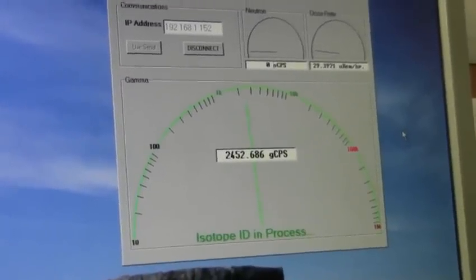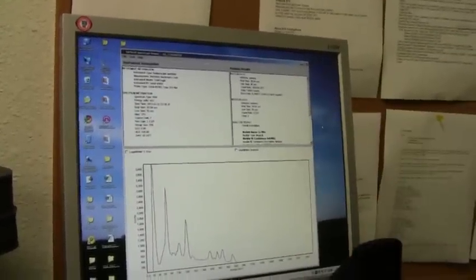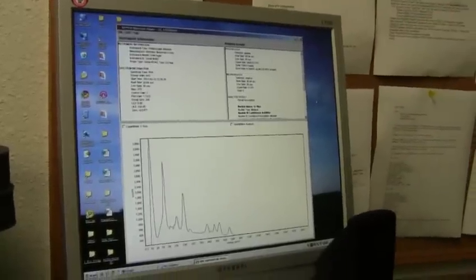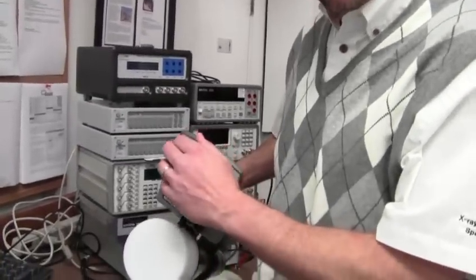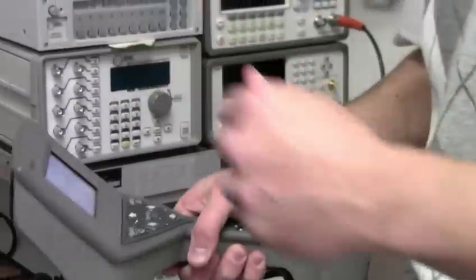This will be done in three seconds. Once the SAM is done doing the analysis, the spectrum and all the correlating data is immediately sent to the user over the Wi-Fi network. This is very useful for an expert in a remote location to view data in real time and support the first responder or the inspector who maybe doesn't have the spectroscopic experience to analyze more complex spectra, multiple sources, or shielded sources. The reports are all saved on the CF card as well, but you also have your data streamed out to the network.